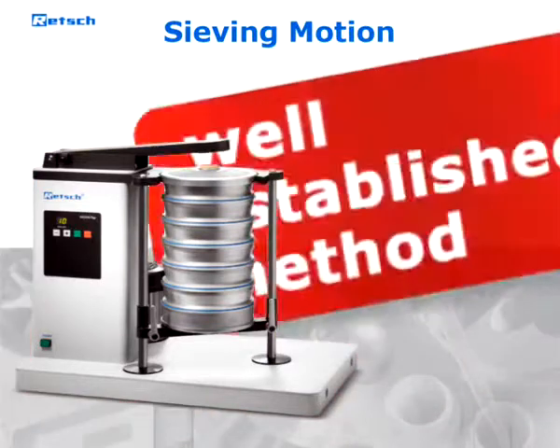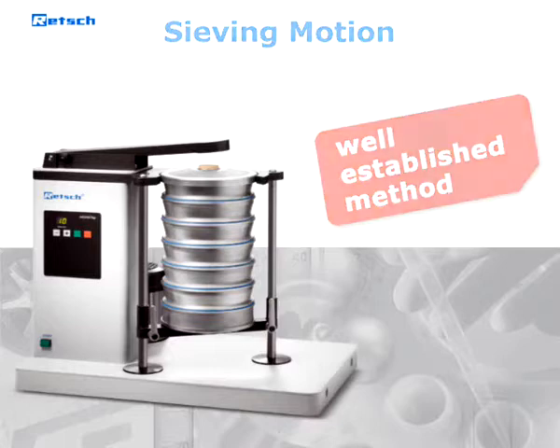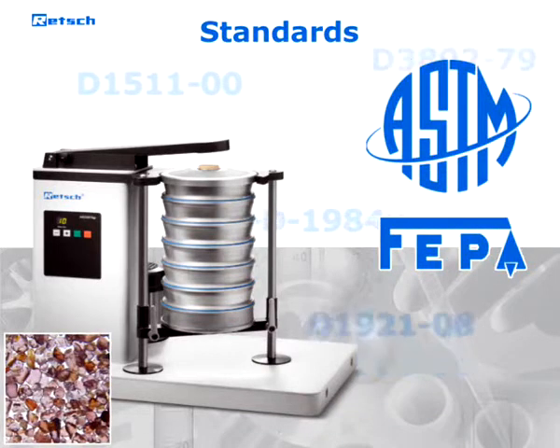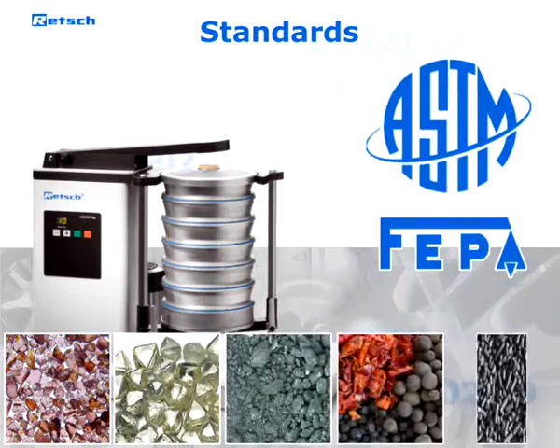Since the introduction of this kind of sieve shaker in the first half of the 20th century, it has been well established and specified in many standards for particle size analysis. Therefore, the AS200 TAP is often used for products such as abrasives, diamonds, metal powder, spices, or activated carbon.